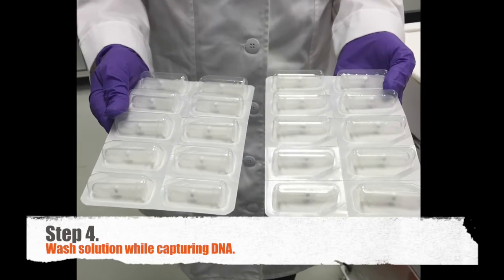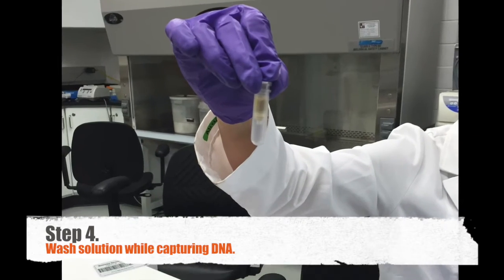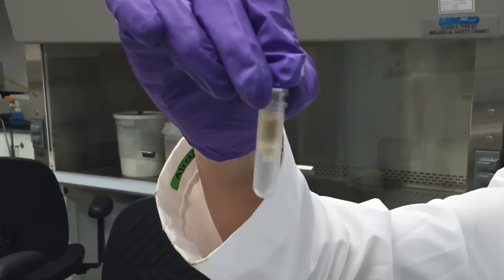Step four: I wash these solutions with rinsing buffers and special filters that capture the DNA molecules.